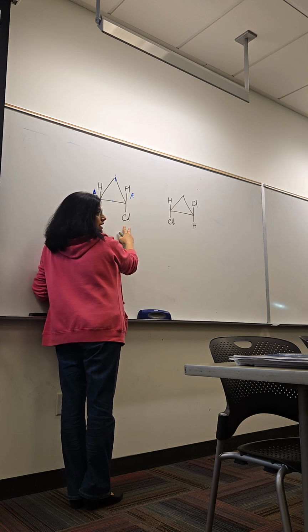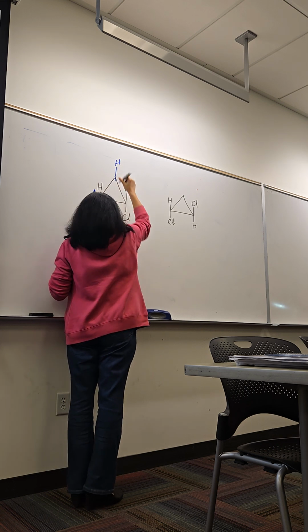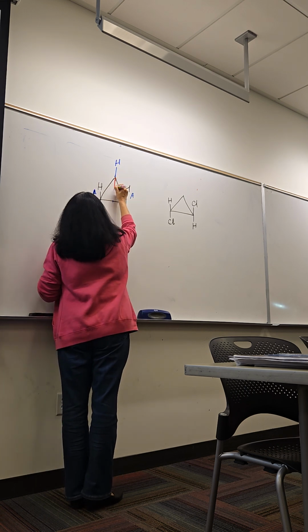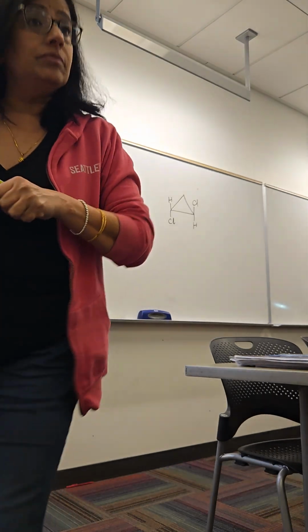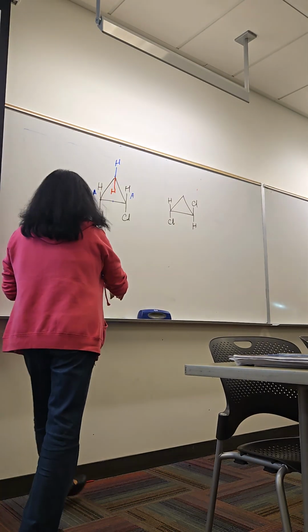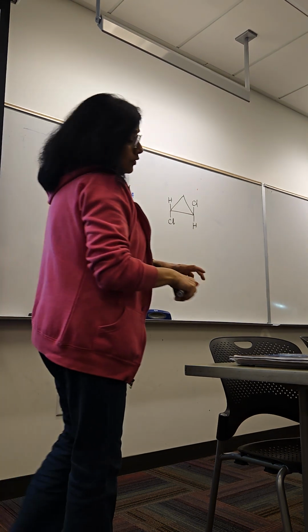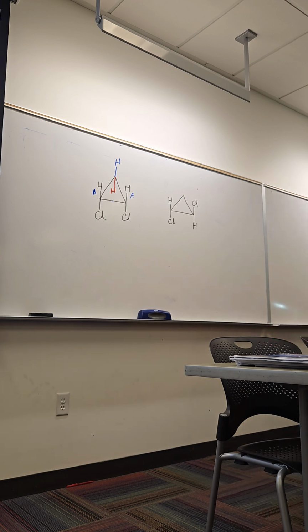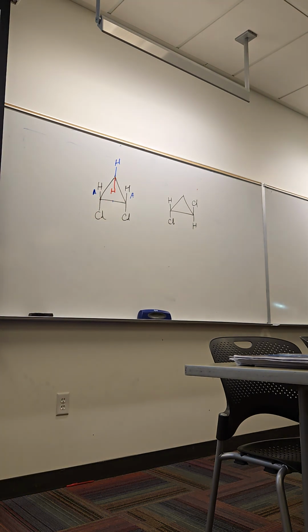Hydrogen, we're looking at hydrogen. It's a proton NMR spectrum. There's a hydrogen here, and there's a hydrogen there, right? What's the relationship? Sorry, Mark? I was thinking they can be like that, right? They can be like this. Oh, this is a different view of the molecule. Okay, okay. I was trying to make the model to show you. So in this view of the cyclopropane ring, it's up or down. Yeah, up and down.